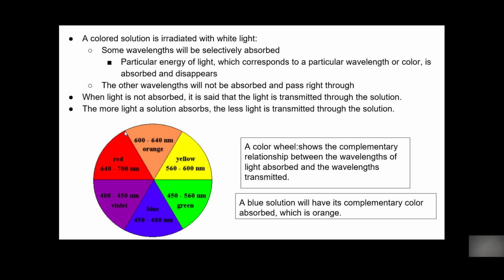So that's basically light just passing straight through that cuvette and nothing's happening. And the more light a solution absorbs, the less light is transmitted through the solution, which is exactly what I repeated in the previous one.